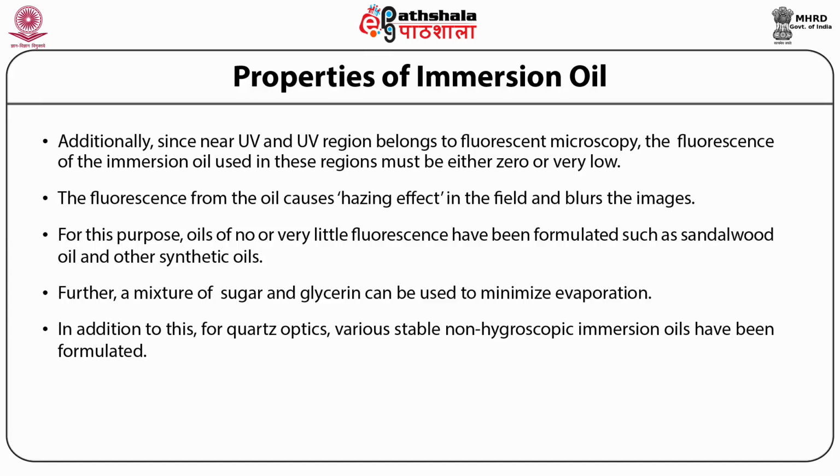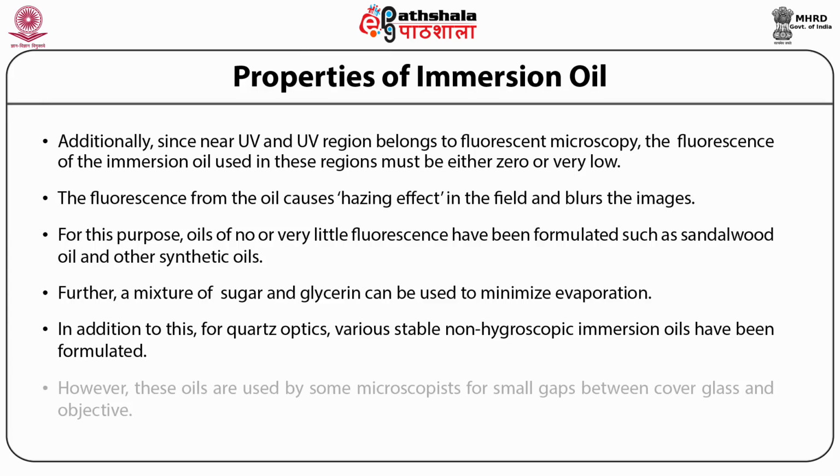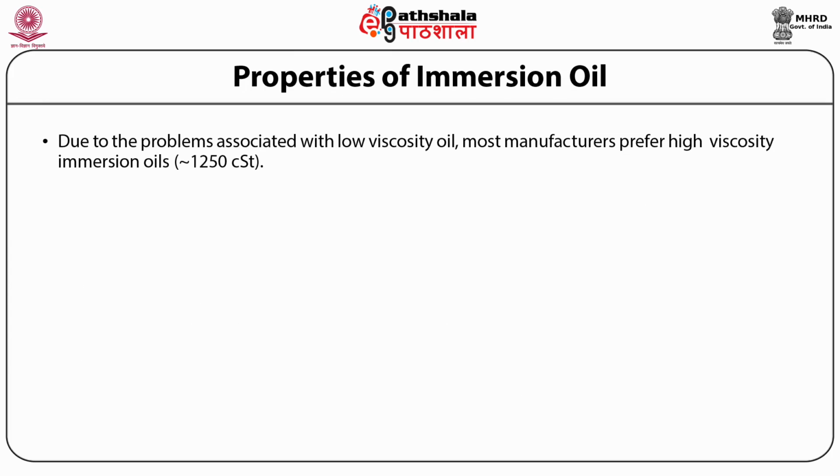Oils having low viscosity are more likely to creep behind the objective when used in large quantity. However, these oils are used by some microscopists for small gaps between the cover glass and objective. In addition to this, low viscosity oils are often less suitable for retaining small bubbles. Due to the problems associated with low viscosity oil, most manufacturers prefer high viscosity immersion oils.